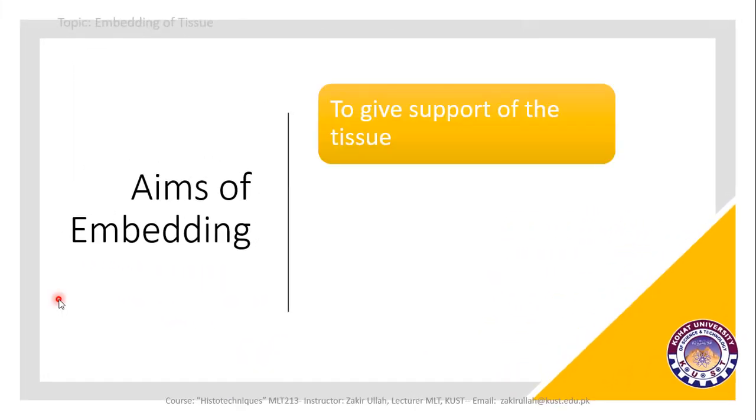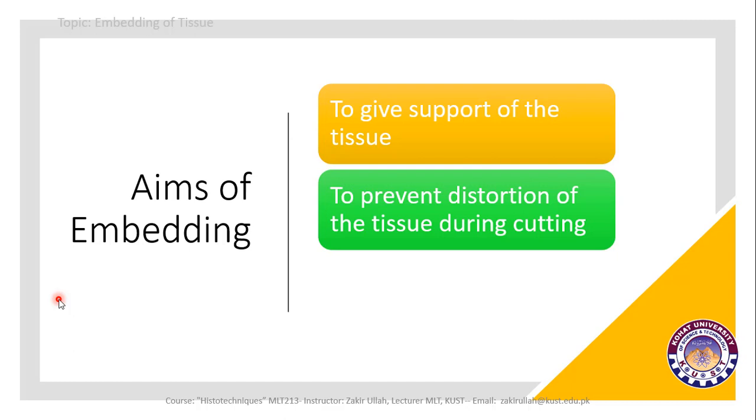The aims of the embedding medium are to give support to the tissue, and second, to prevent distortion of the tissue during cutting.